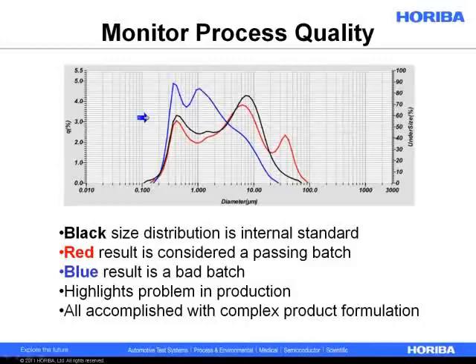If you've ever looked at paint or if you've ever thought about paint, you know that it's a very complex material. It has lots of different things added to it. It's going to have pigment, it's going to have stabilizers, it's going to have spacers, it's going to have all sorts of different polymers and resins, and it's very complex, which is typically a challenge for diffraction if you care about knowing exactly what ratios are in the material. But if what you really care about is knowing that this was a good paint batch and that's a bad paint batch, diffraction is perfectly well suited.